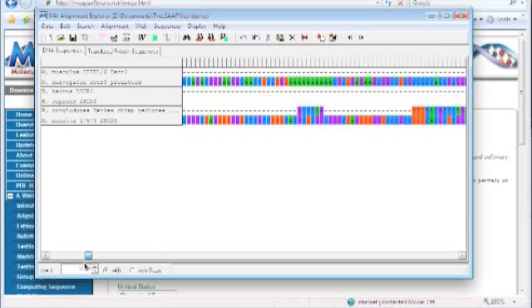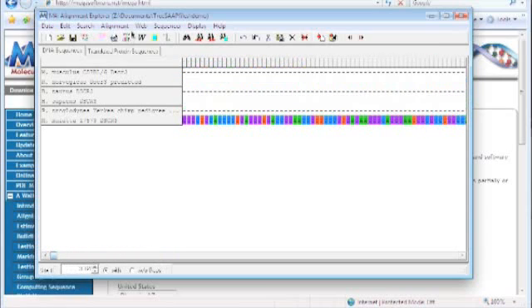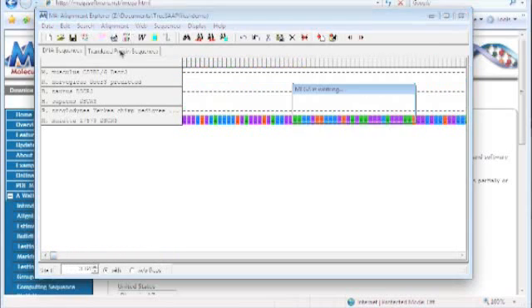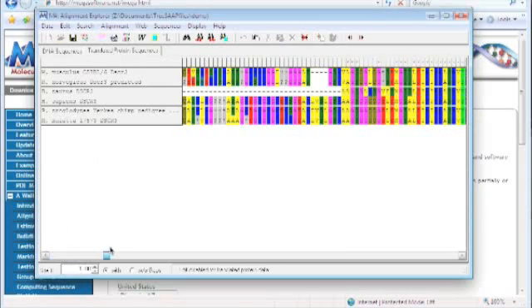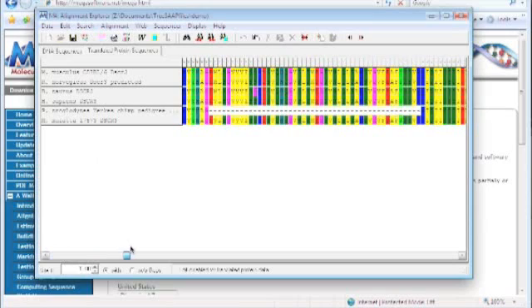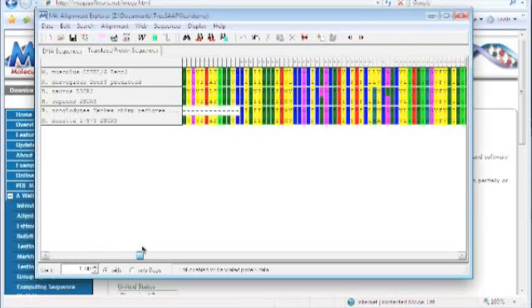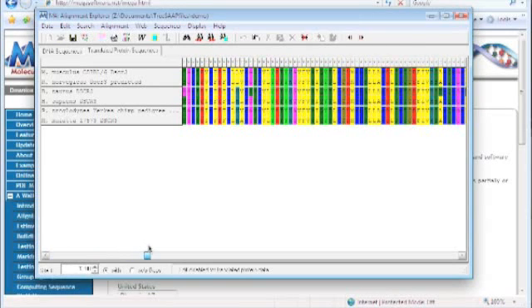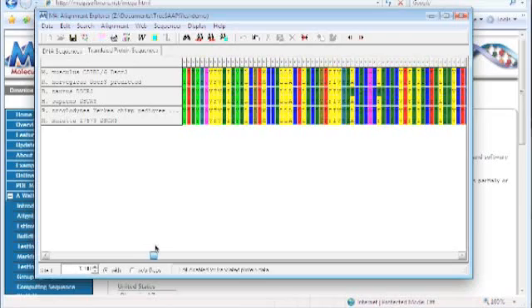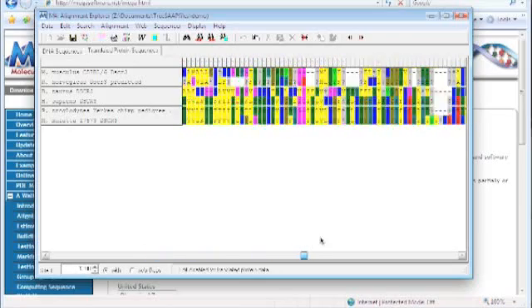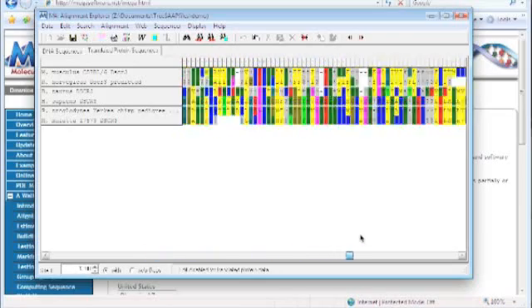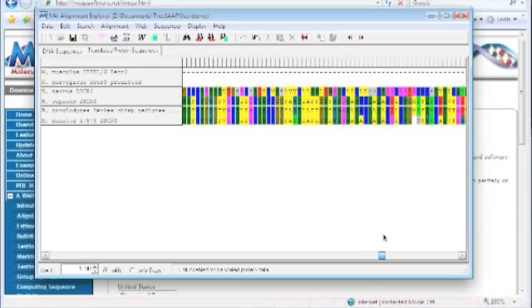We can also view the translated protein sequences — all you have to do is click that tab right there, and here are all the proteins. Again, this region is highly conserved; you can see just by looking at it, because everything lines up so well. However, if you go towards the ends, it starts falling apart.